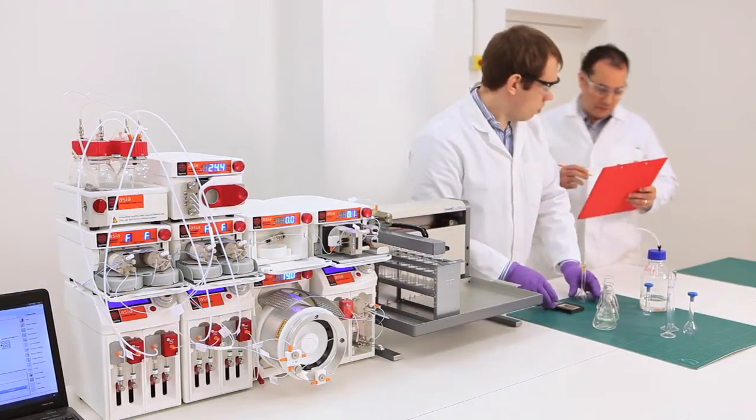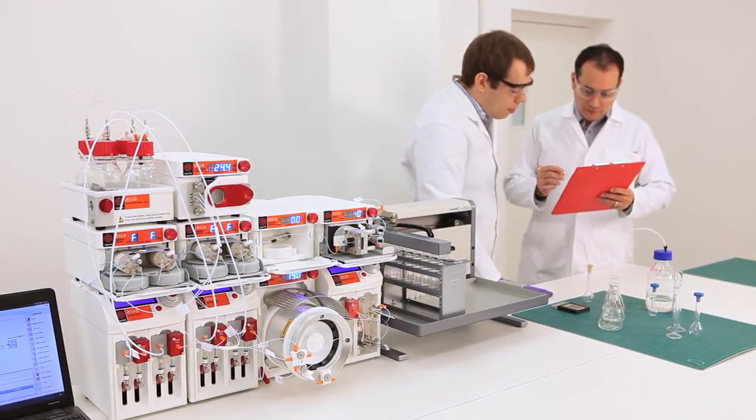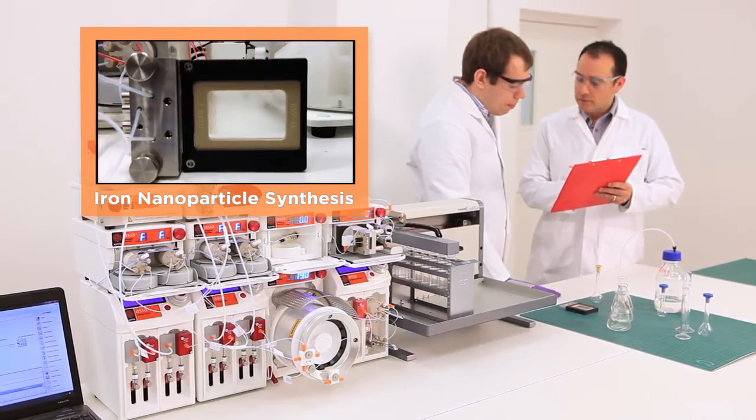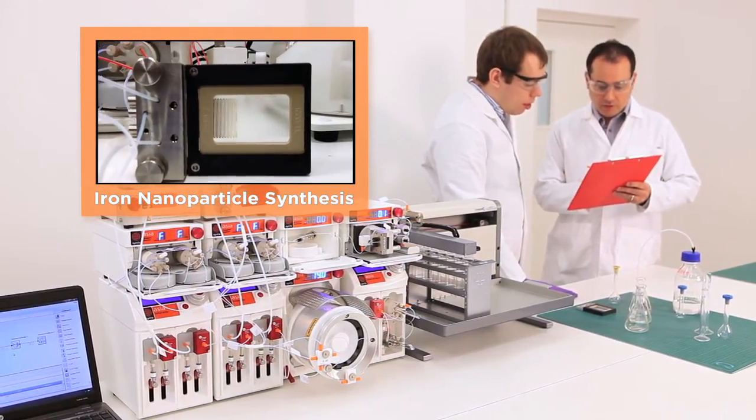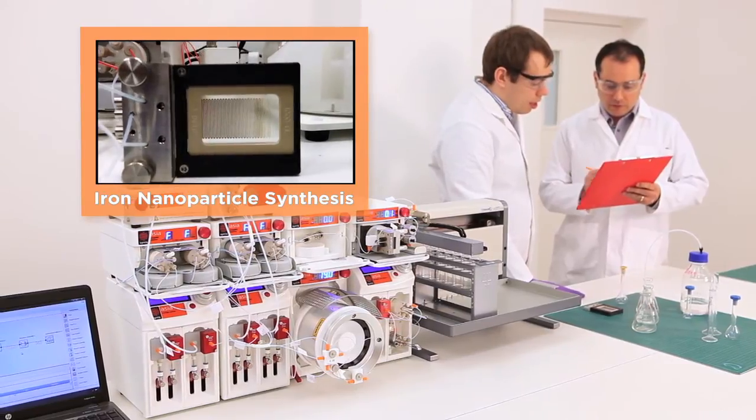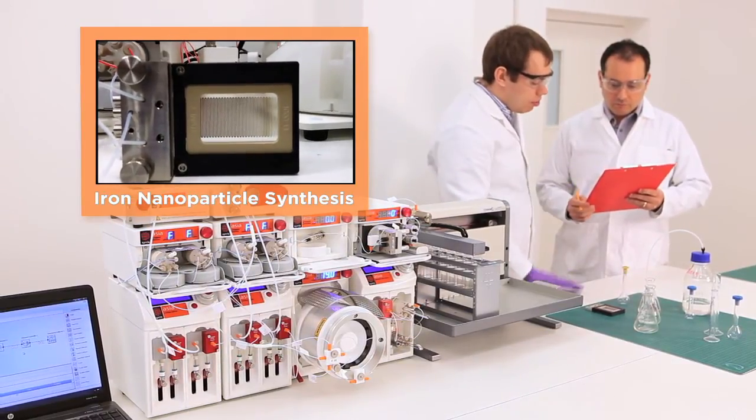The Asia Flow system is also well suited for nanoparticle synthesis due to the ultra-fast mixing and excellent temperature control. Asia Flow reactors and pumps enable accurate control and reproducibility of nanoparticle growth and nanoparticle size distribution.